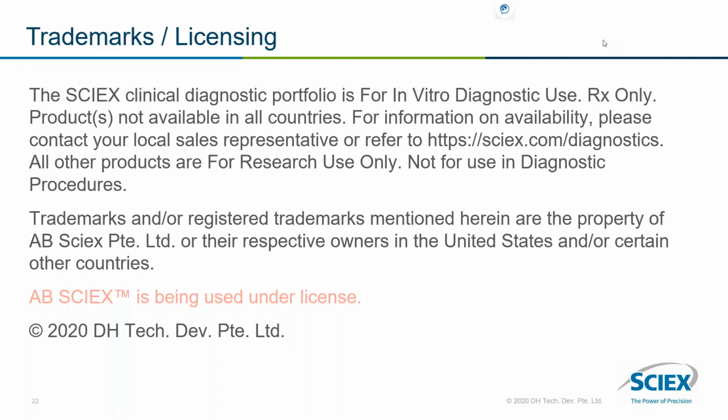I don't think it addresses that. Certainly, that wasn't the intent. The WebSocket is a two-way communication channel between the ADF file and the SCIEX Analyst software, but that's really the extent of what we've done there. Okay, thanks.